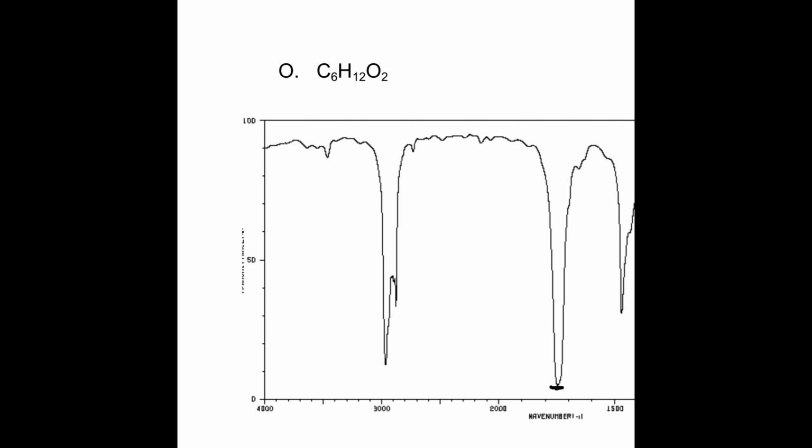All right. So we are given the formula C6H12O2. And we first need to figure out what the structure of this formula is going to be. We see that there are two oxygen atoms present. And with these two oxygen atoms, we can assume that there's either going to be an ester functional group or a carboxylic acid functional group present.